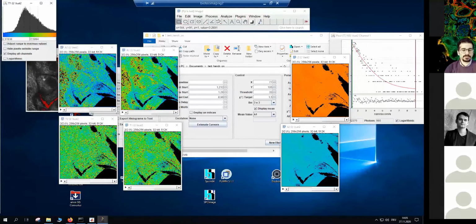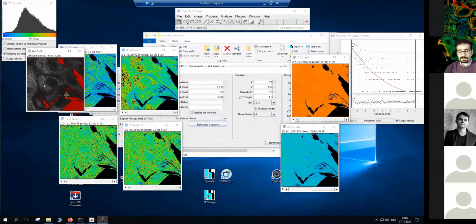Here, everything is ready. If I would like to do some segmentation, either I do that on the intensity image that we have here, or if it would be more apparent in the FLIM data, you can use the FLIM data as the basis of the segmentation, and then we find the region of interest after the segmentation. So we define where we would like to do the measurements, and then we go back to the actual data that we want to measure. This is a good thing about using these plugins. So I'm open to questions regarding SLIM Curve. Otherwise, I would move to the other plugin.